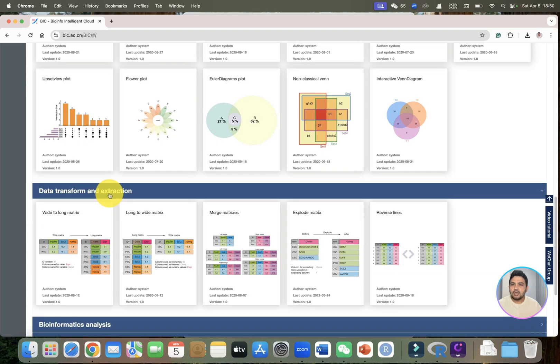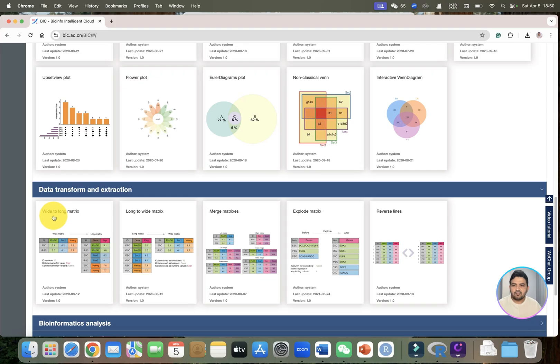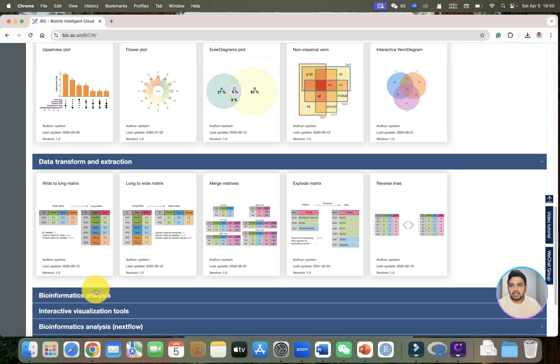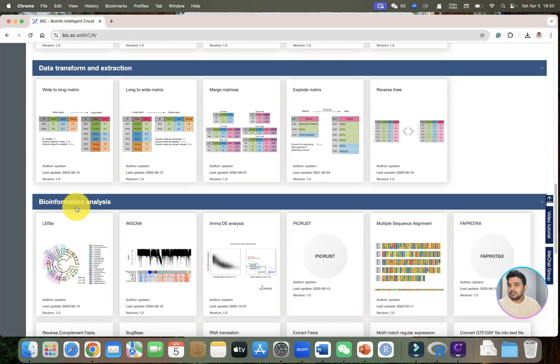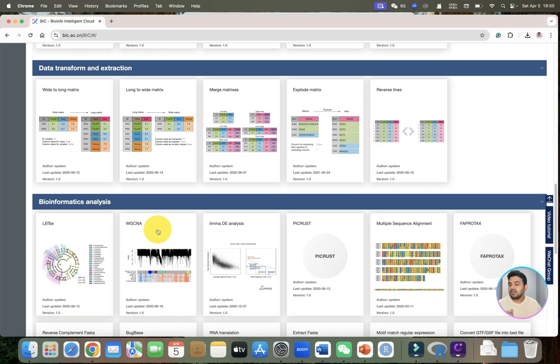If you look at data transformation and extraction, it is very easy. You can see wide-to-long matrix transformation and long-to-wide matrix transformation can be done. In addition to that, for bioinformatic analysis, we can do things with just a single click — like LEfSe, WGCNA. We can just input our expression data and get all the steps done.